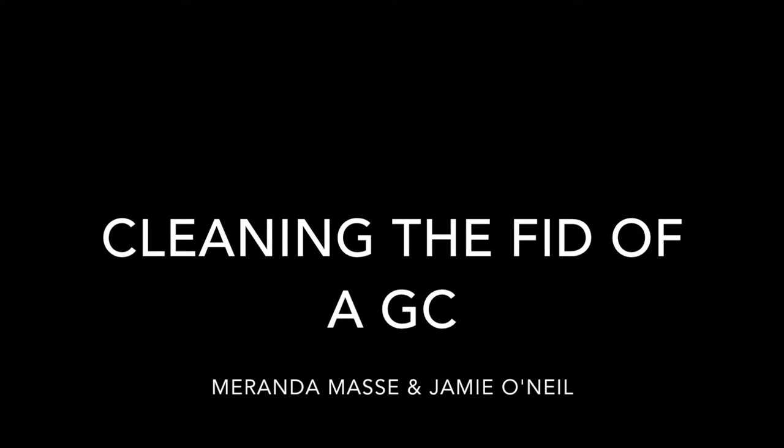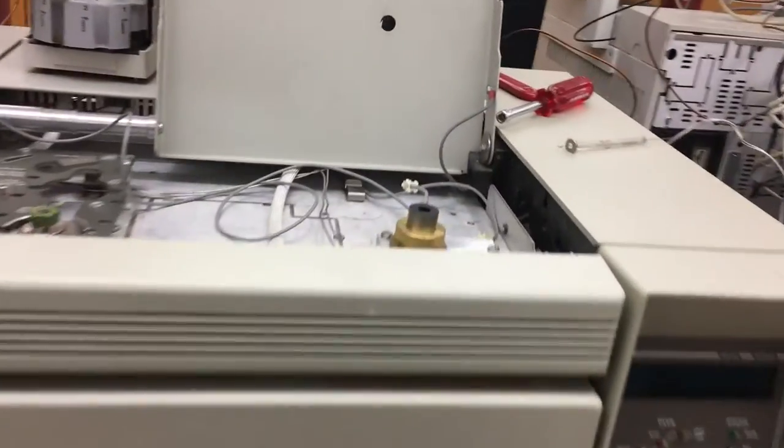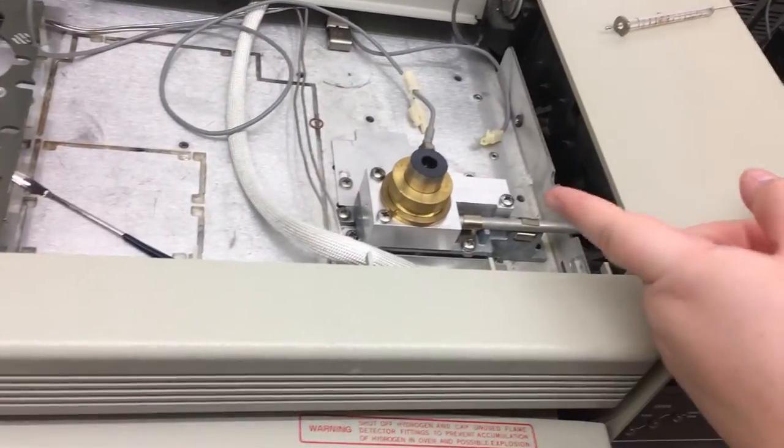Today we will be showing you how to clean the flame ionization detector within your GC. The flame ionization detector is located in the housing unit shown.